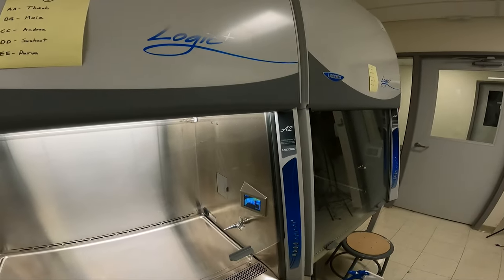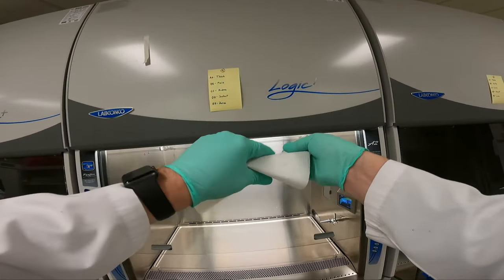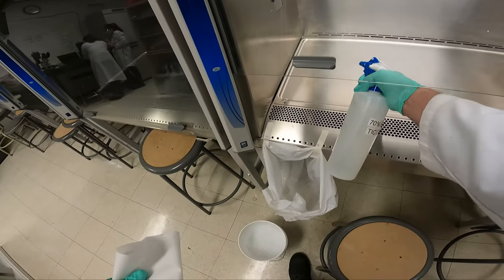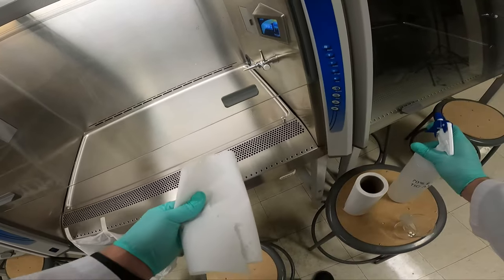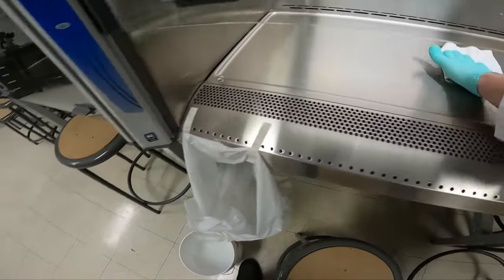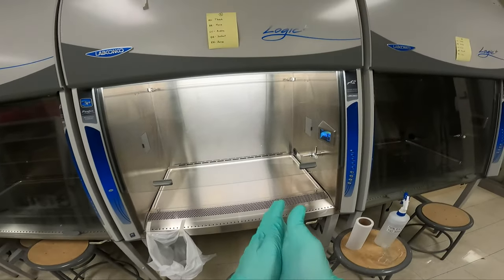If we look at the symbol there, the 'please wait' symbol is gone, so now I can sterilize my hood. I'll rip off some paper towel, get my 70% ethanol, and spray the entire plate at the bottom. I will then wipe from the back of the hood to the front of the hood, moving back and forth, pulling contaminants out of the hood. I can then place this into my garbage bag.